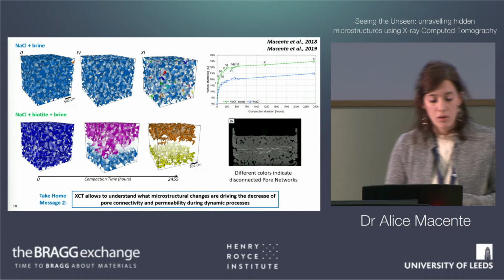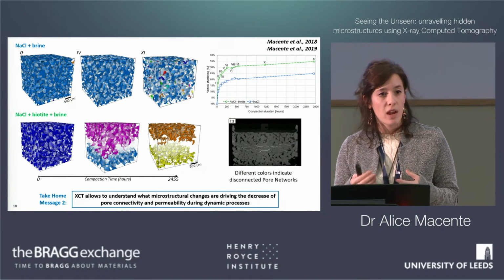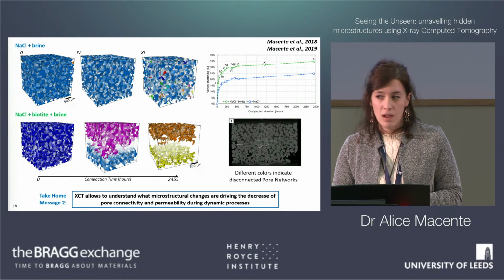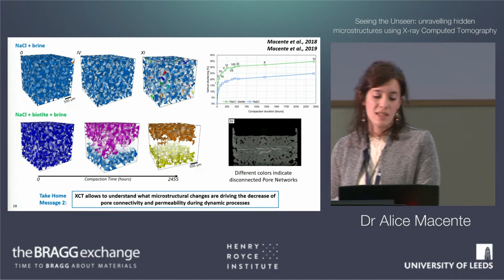So, second take-home message is that XCT can help us to understand what are the microstructural properties that drive changes in the large-scale behavior. So next up, I'm going to talk to you about some other application which you might want to use XCT.